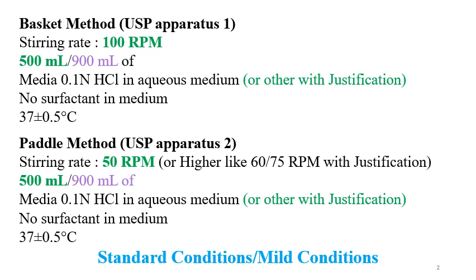So these standard conditions are for the formulations which are immediate release and containing highly soluble drug substances.